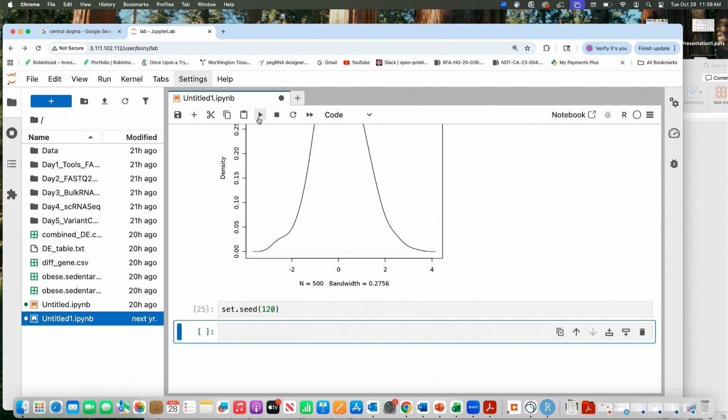Always, when you do an analysis at the beginning of R, set it to some number that you always use, in case you need to repeat it, or at some point in your analysis you're doing something that generates some random starting point.